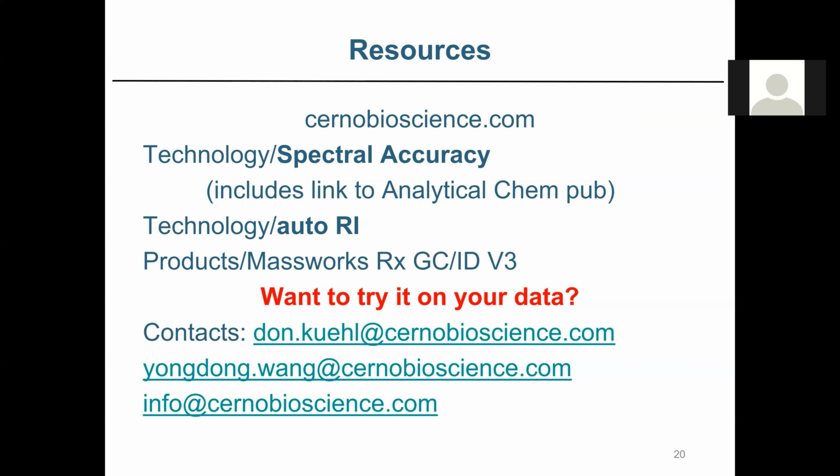If you think about it, when you do EI, think about MS/MS when you're really trying to pick apart a structure. One problem is you really need to know what the molecular ion is, and you don't always get a molecular ion. So the solution to that, ideally, is you run something like CI.